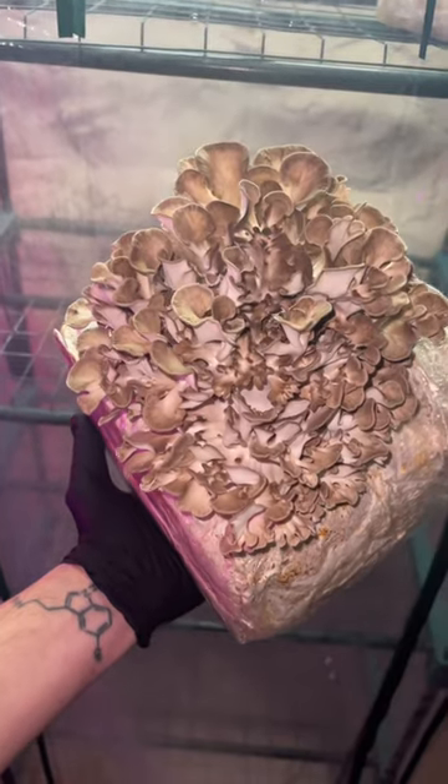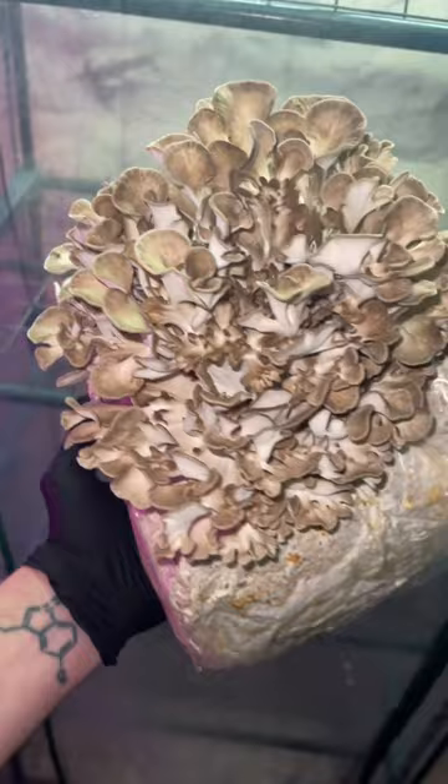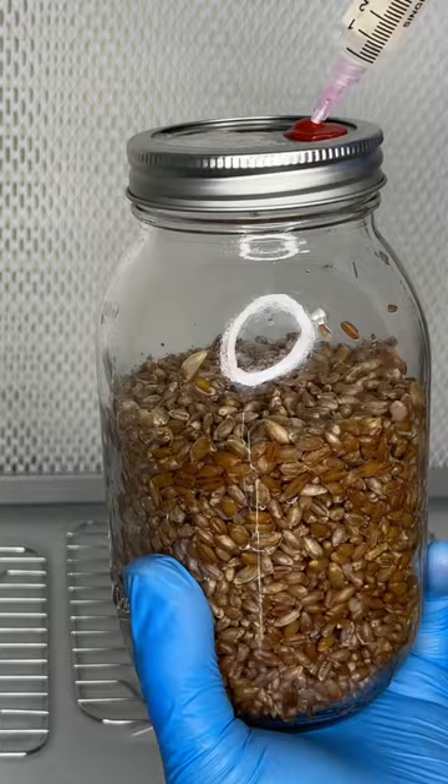This is Grifola frondosa, otherwise known as maitake or hen of the woods mushroom. It can be grown by inoculating sterilized rye grain with two milliliters of hen of the woods liquid culture.